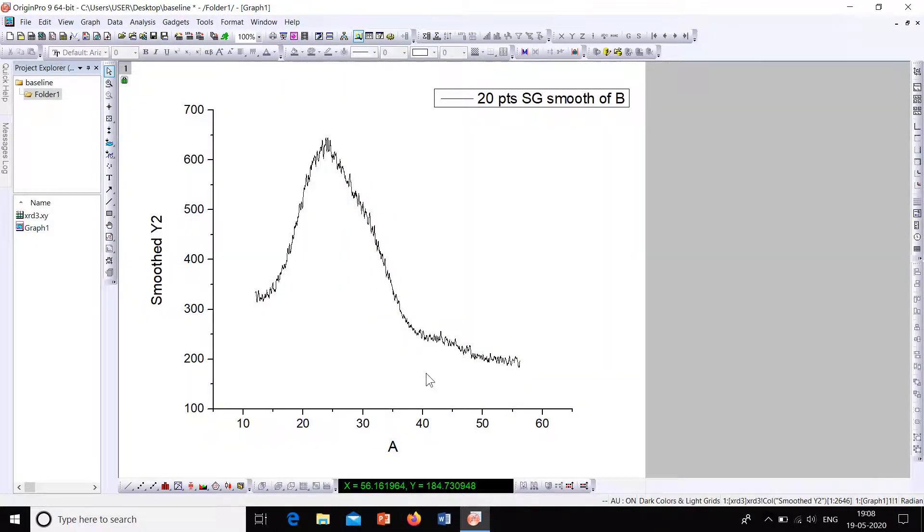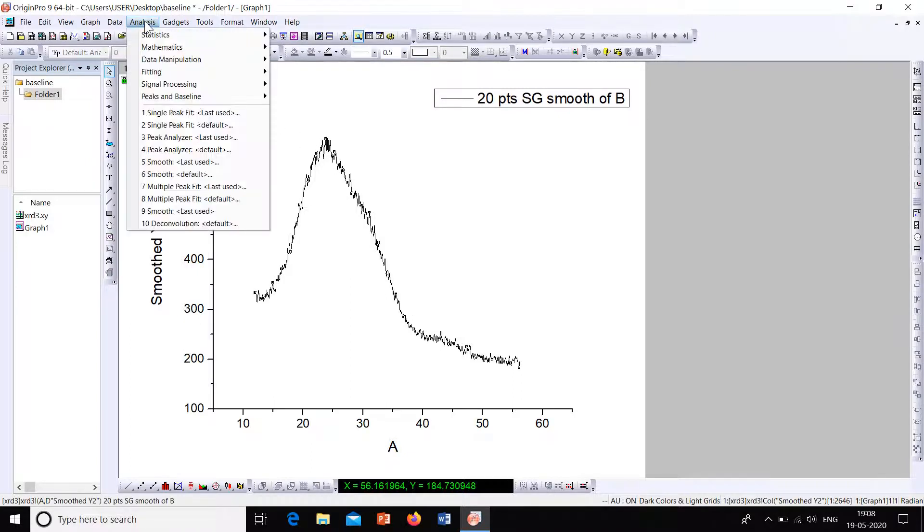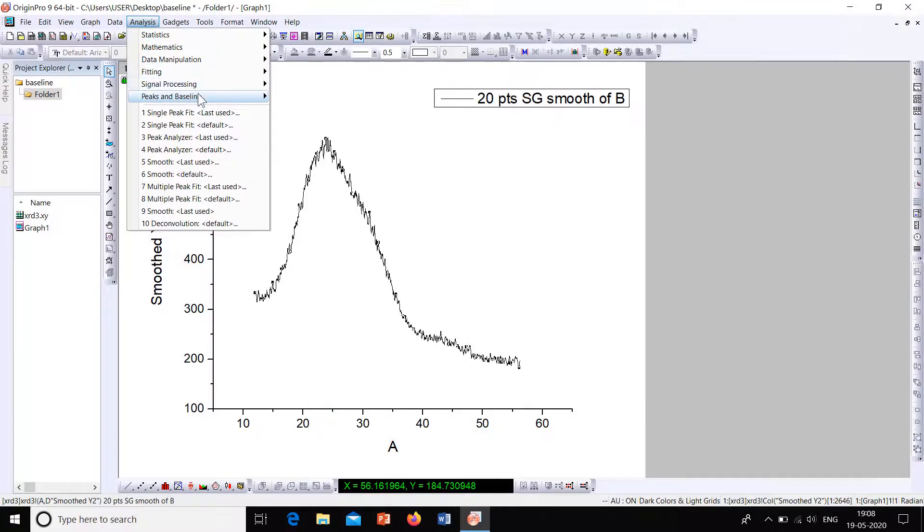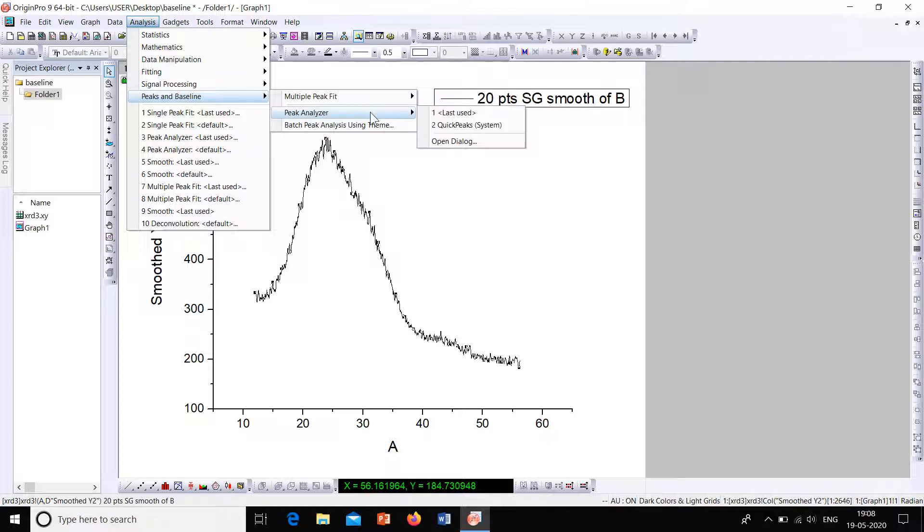Now let's see how to correct the baseline for this plot. For that, single click onto the graph and then go to the option Analysis. From there select Peaks and Baseline, then select Peak Analyzer and go to Open Dialog.